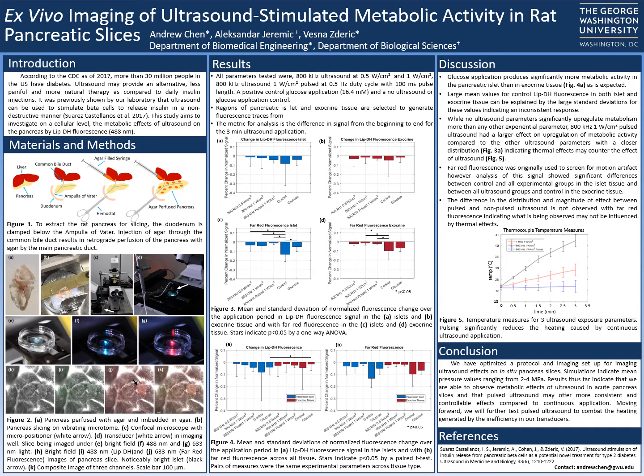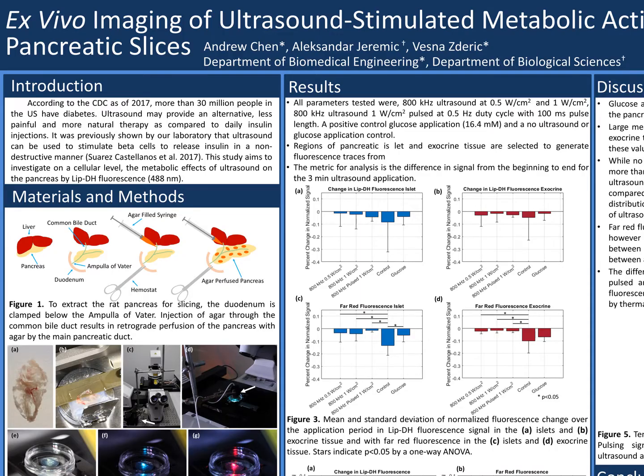This work looks at therapeutic ultrasound's effect on metabolic activity in the rat pancreas slice. This work follows previous work from our lab, which looked at the effect of therapeutic ultrasound on cultured rat beta cells and showed that this ultrasound could induce insulin release from these cells in a reversible manner, meaning that the cells would recover and there was not excessive cell death.